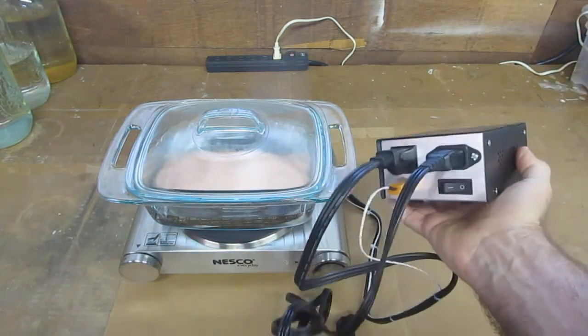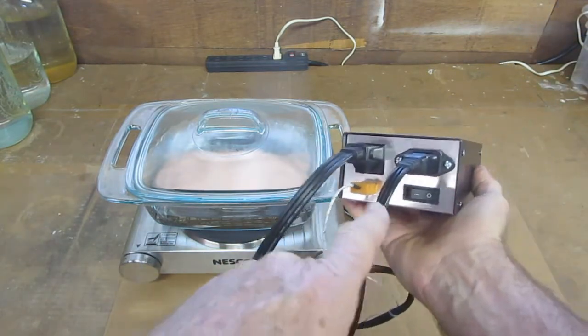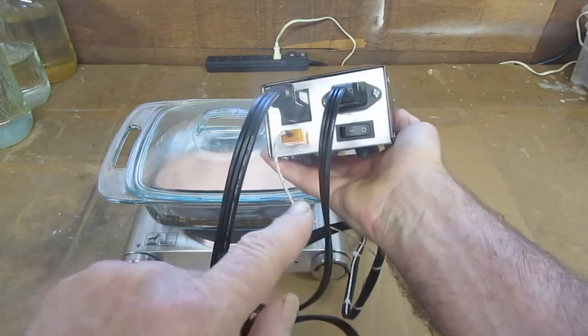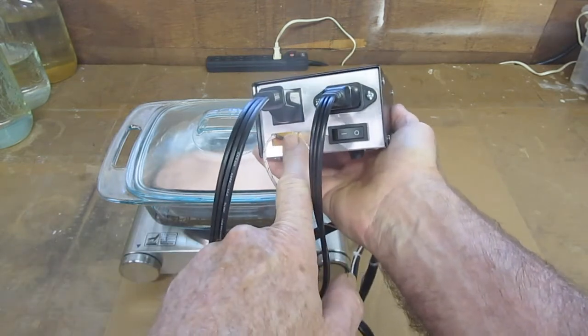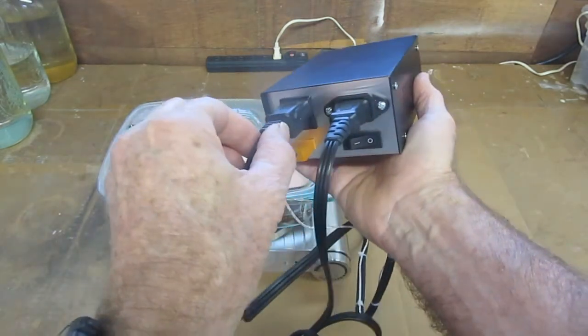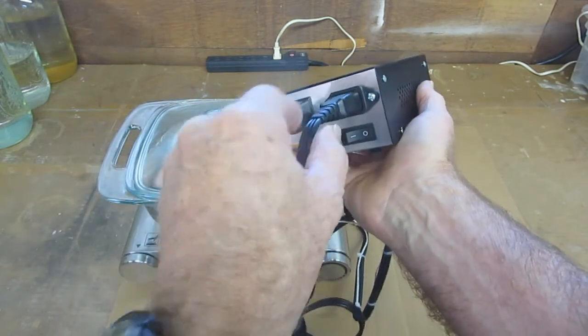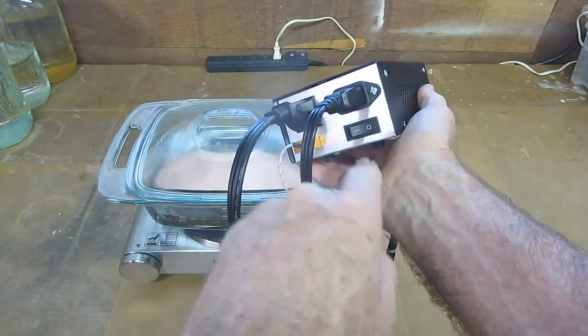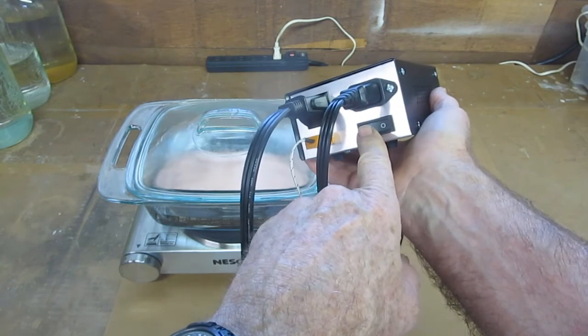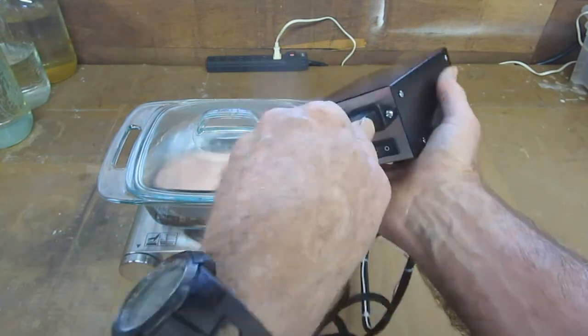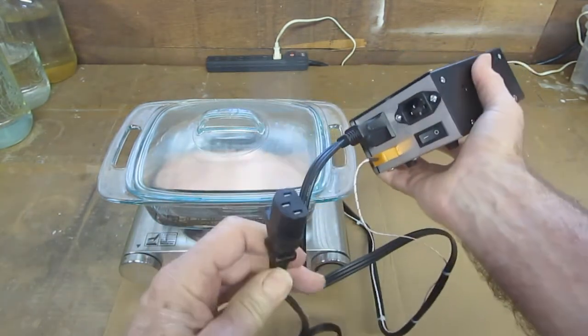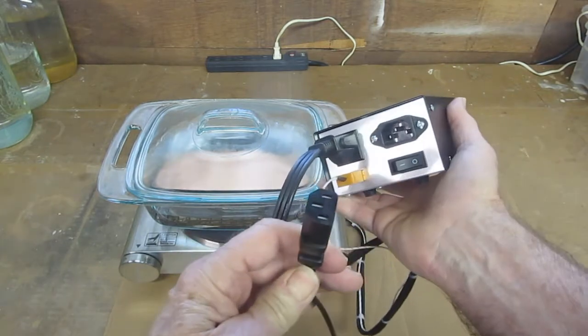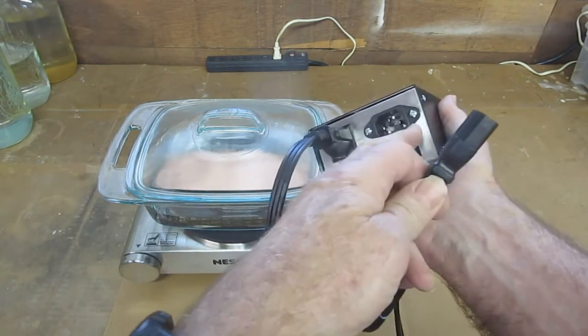There's where the thermocouple plugs in, this is where the hot plate plugs in, this is the power cord, and this is an on-off switch. The power cord is just a standard IEC power cord.